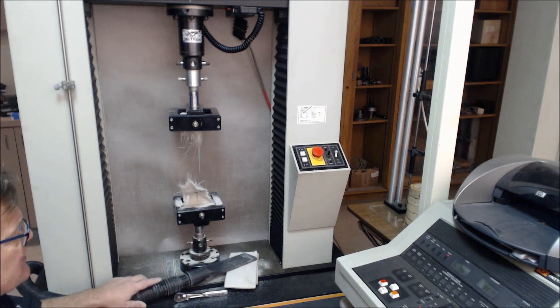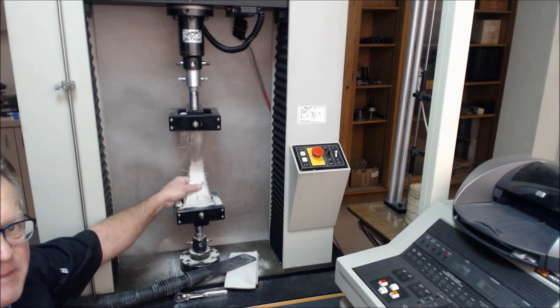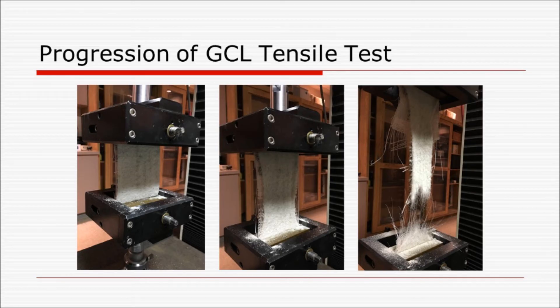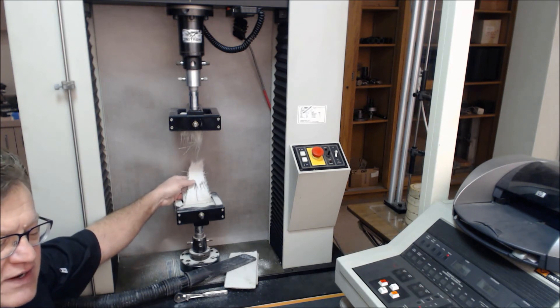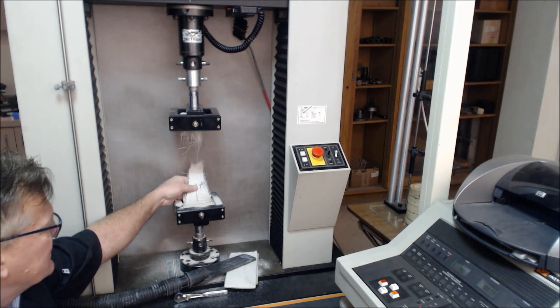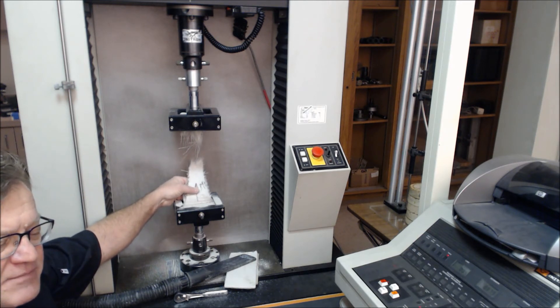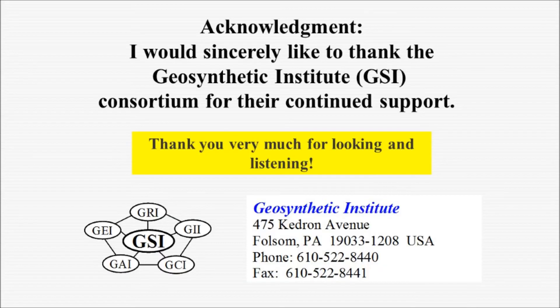You'll run five specimens in the machine direction. You'll take the value — so many pounds or so many newtons — and then divide that by four inches or 100 millimeters to get your GCL tensile strength for GRI GCL3. This is ASTM D6768 for GCL3 specification.